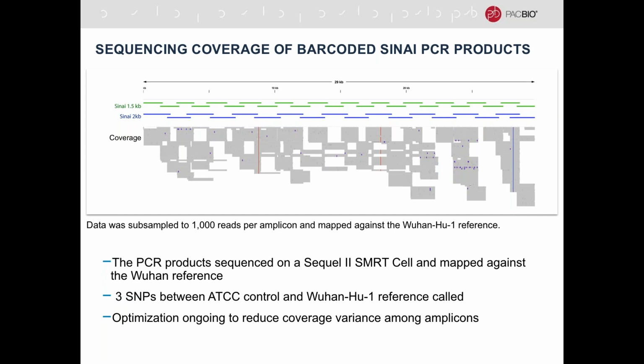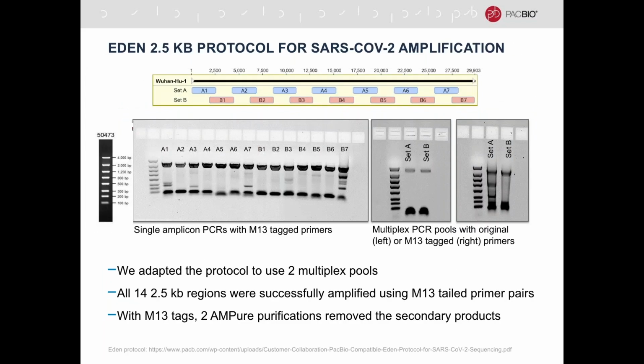And then I will just note that we are continuing to work with this protocol in-house to do some primer rebalancing to reduce coverage variance among the amplicons. So the second protocol we have been working with is the Eden 2.5 kb protocol.